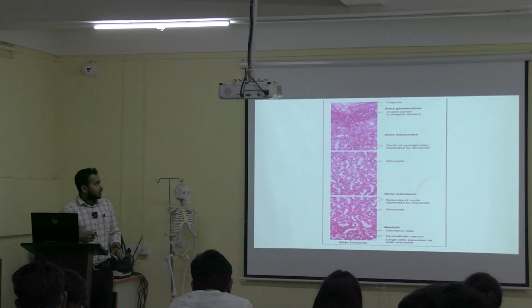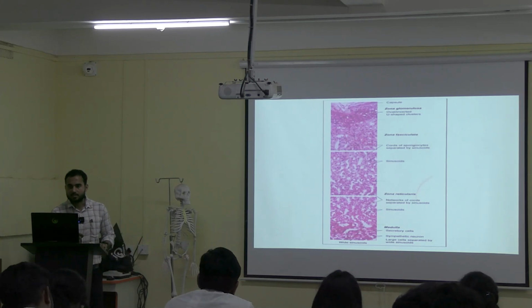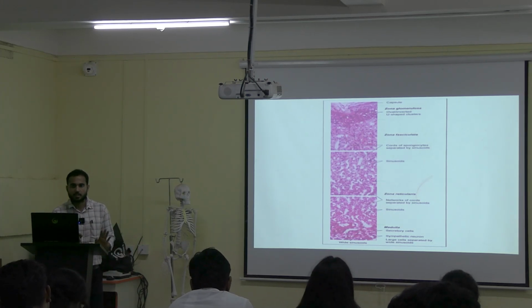Okay, so now we'll go to the lab and then we'll identify the slides. First we'll identify the slides of pancreas, followed by the suprarenal gland.